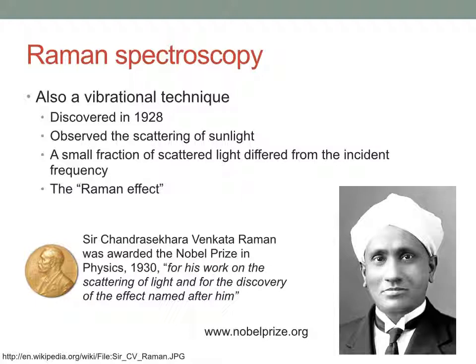But the other thing is that Raman is quite a low intensity technique. For fluorescence, if I have a fluorescence quantum yield of 0.4, that means 4 in every 10 photons are coming out as fluorescent photons. So 4 in 10 is quite a lot. Whereas when I'm looking at Raman, I'm genuinely looking at 1 in a million.